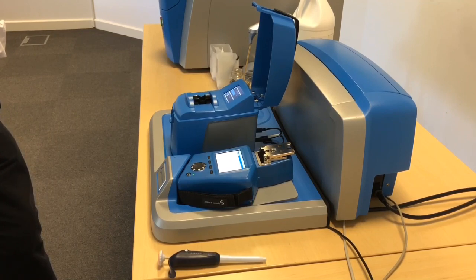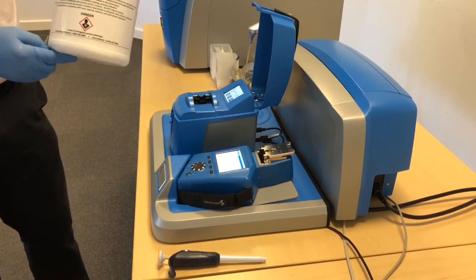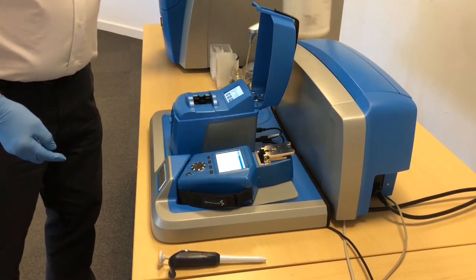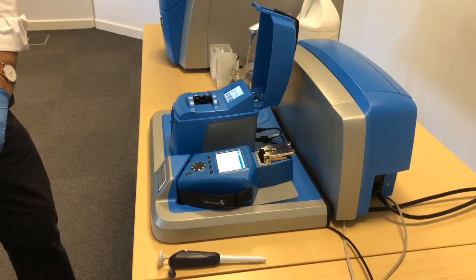That beep is the particle counter saying it's just about done with processing the sample, and shortly it will ask me to start the flushing cycle to flush out the old sample ready for the next. You do that with this flushing solvent here, which is guaranteed to be minimum particle count.